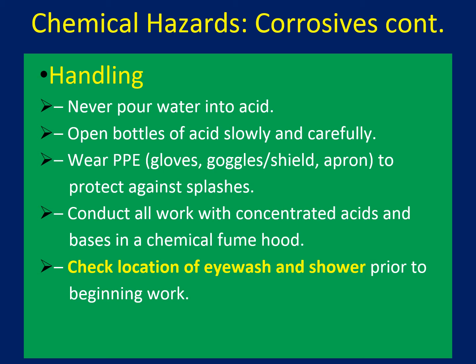Wear personal protective equipment like gloves, goggles, and aprons in case of splashes. Conduct all work with concentrated acids and bases in chemical fume hoods. Make sure to check the location of the eye wash and shower in advance before starting the experiments.